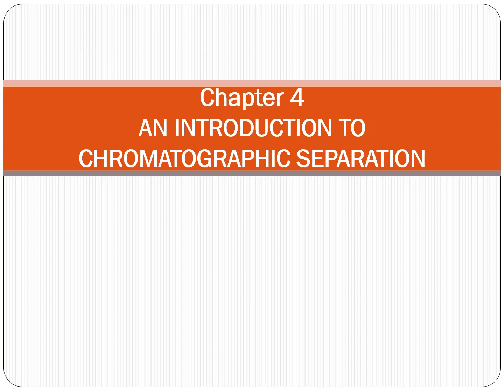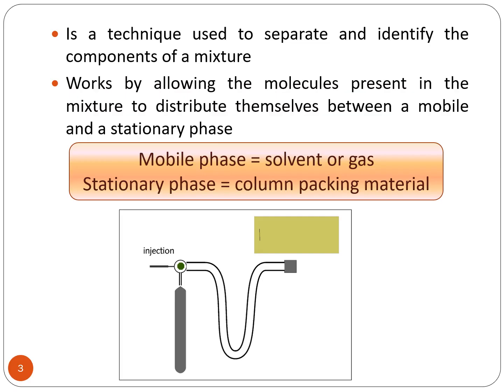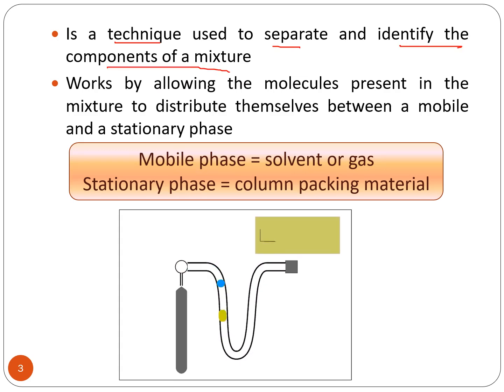An introduction to chromatographic separation. Okay, so what is chromatography? Chromatography is a technique used to separate and identify the components of a mixture. So it is different from the concept of spectroscopy.